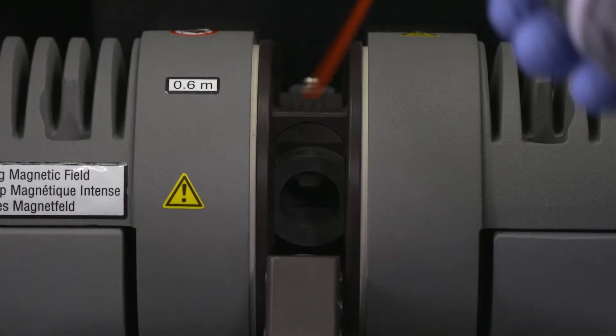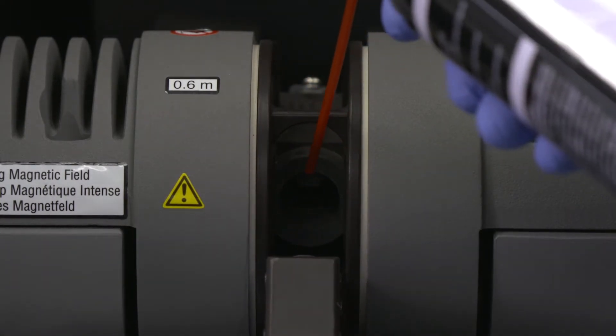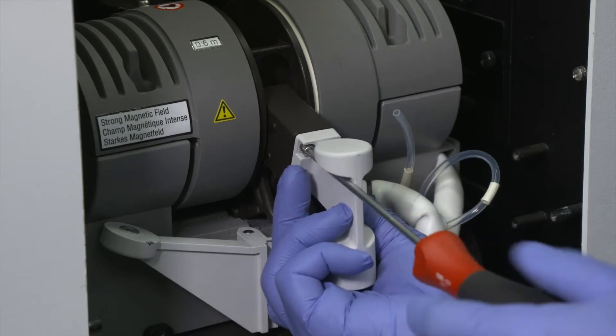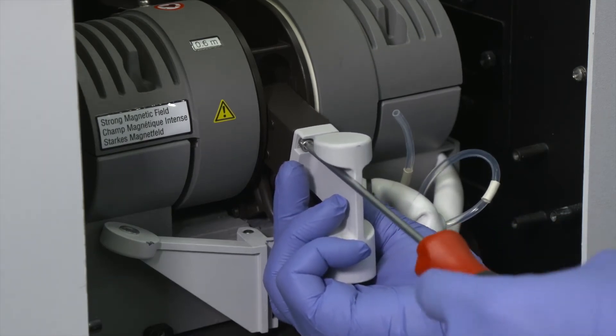Then blow out any graphite particles from the contact housing with clean, dry compressed air. Replace the pressure cylinder carefully, ensuring no damage to the o-ring.